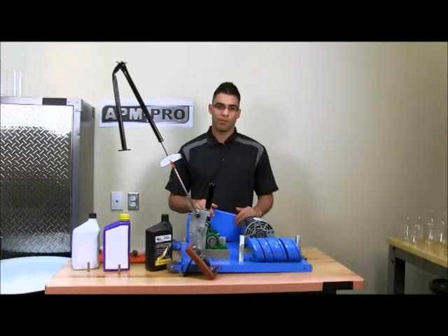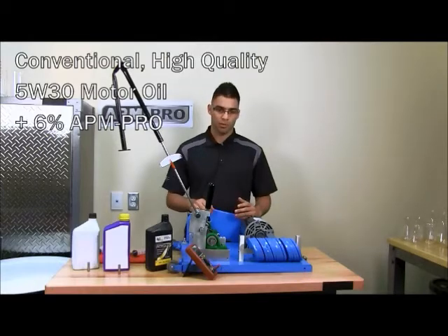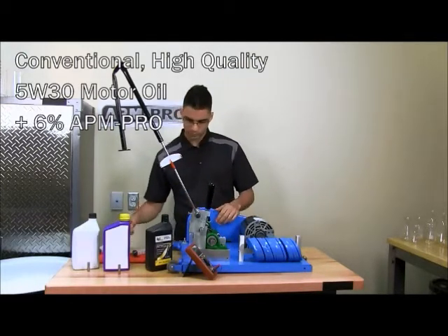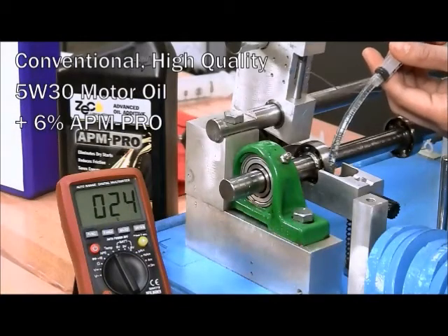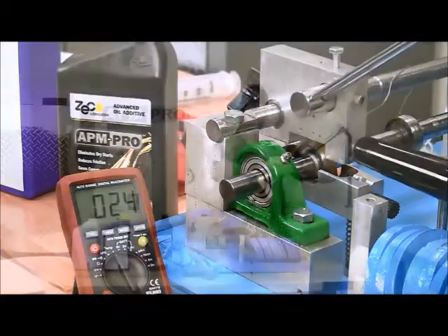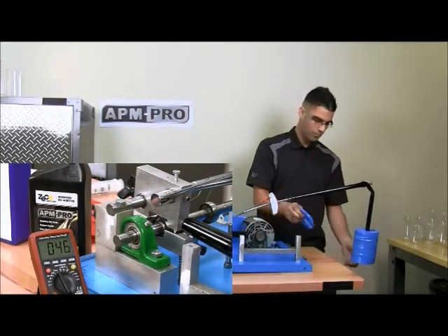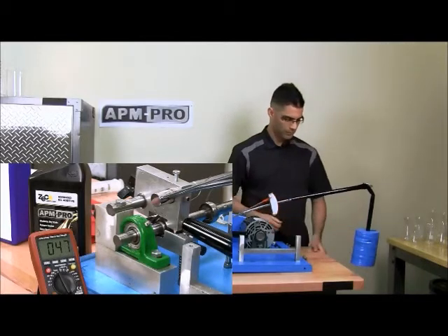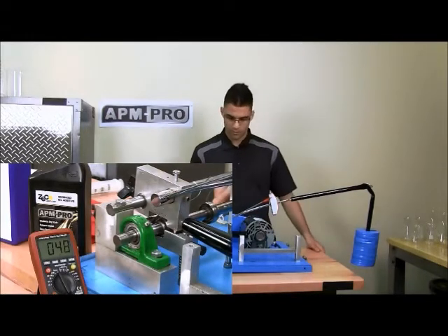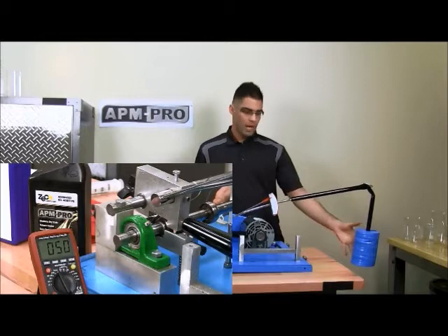We have once again cleaned the bearing for a fresh start. We will be using the motor oil and adding six percent by volume of APM Pro to the bath. We will be repeating the same tests as before. We have reached all sixteen weights and it is still very quiet.